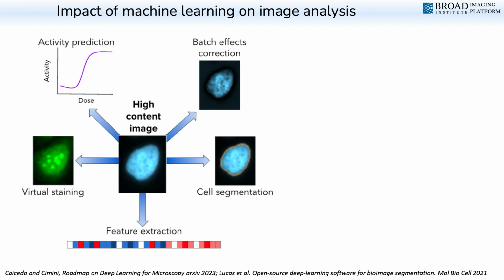So I'm going to focus just on one aspect of it today, which is using images of cells for this purpose, for discovering drugs. It's one of the many ways in which you can discover drugs.